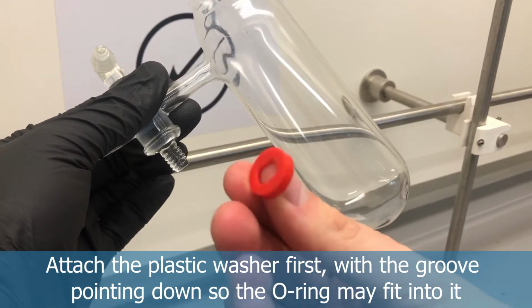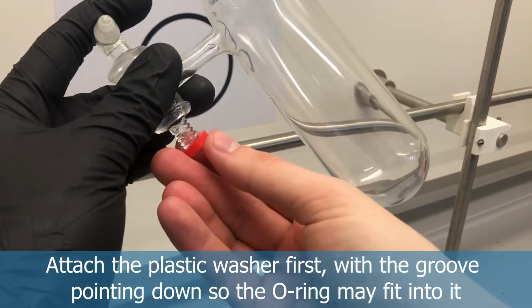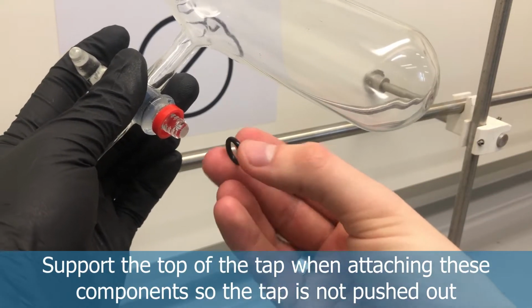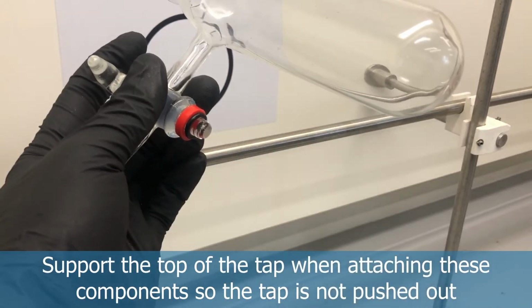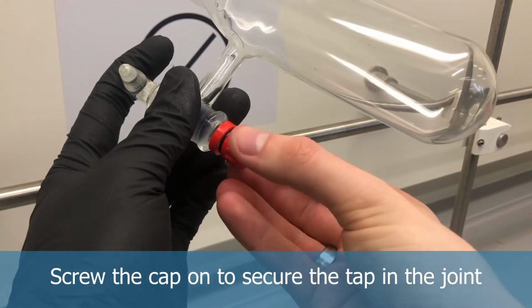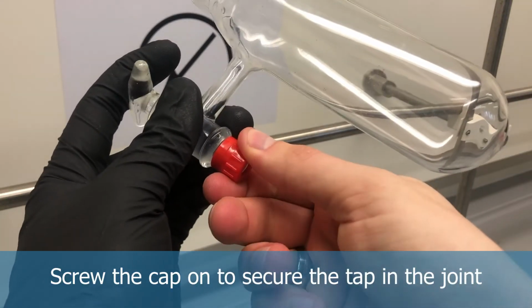The washer goes in and there's a groove on the underside of it that will fit our O-ring in, which goes on next. And then our tap head can be placed on and screwed fairly tightly, but we're not securing the tap in place. It should still be able to move. It's just there to ensure it doesn't pop out or be knocked out. So there's a nice fit there and you should still be able to move it.